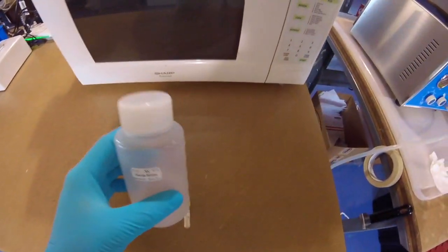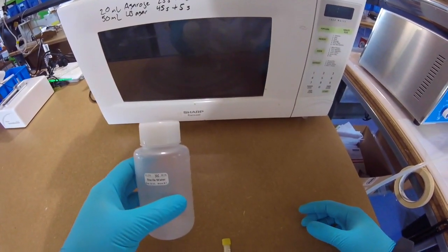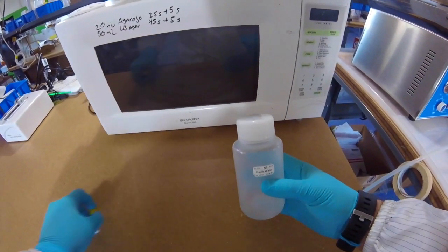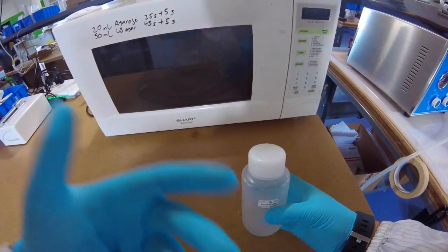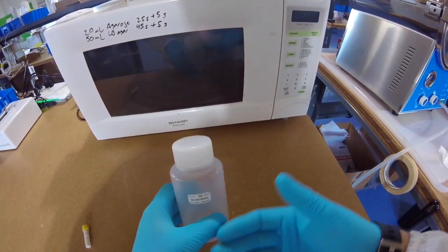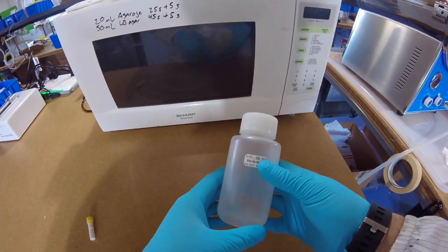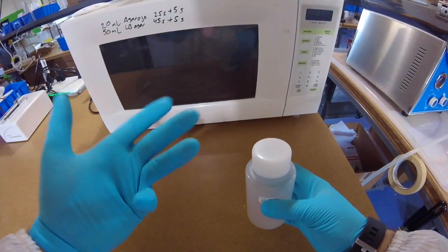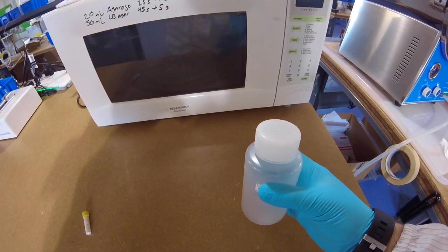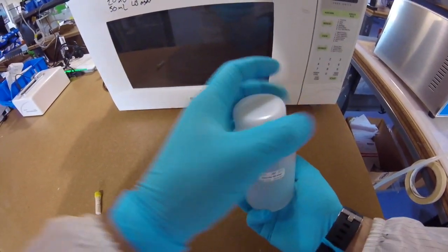It really depends. The timing depends on the power of your microwave. This is a regular run-of-the-mill 1,000-watt microwave, and it typically takes 45 seconds to do a single bottle of water. If you have a larger group and you want to do multiple bottles of water, you'll have to add more time for them to work. But it actually ends up working out to be the fastest if you have your students do one bottle at a time. Just form a line, 45 seconds, done is usually the case.